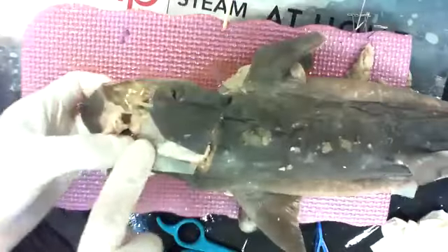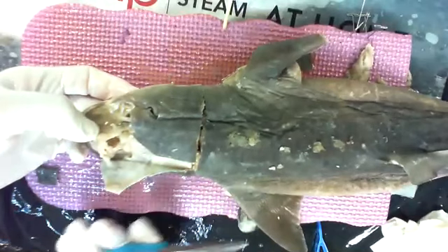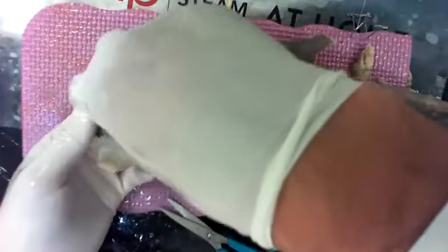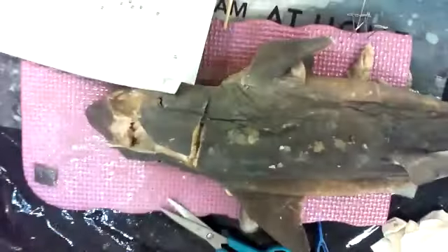And you can do the same thing. You can go right above this. The brain will kind of move out of your way if you push scissors in. Like this. Go down. Boom. And then I can pull off those pieces. But it all depends on how slow you want to go. The picture of the brain's right here if you want to try and replicate it.